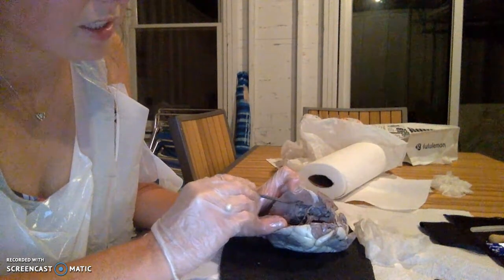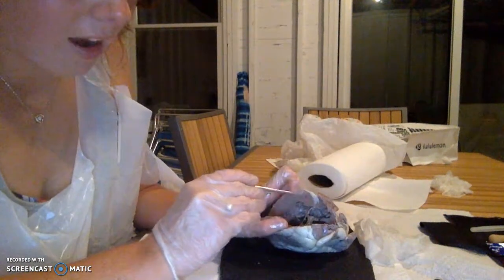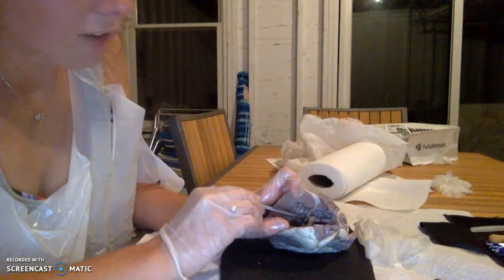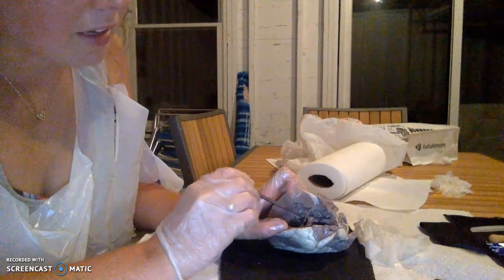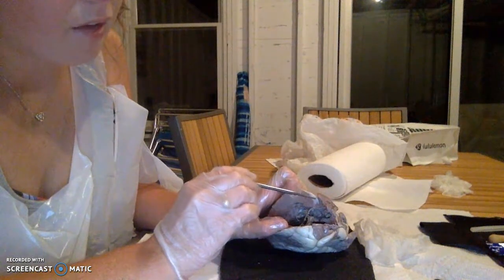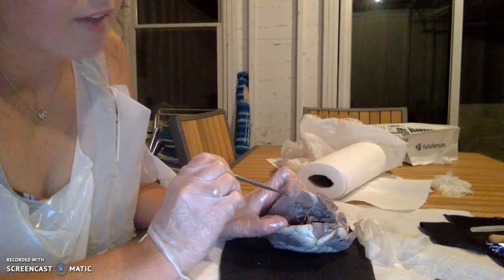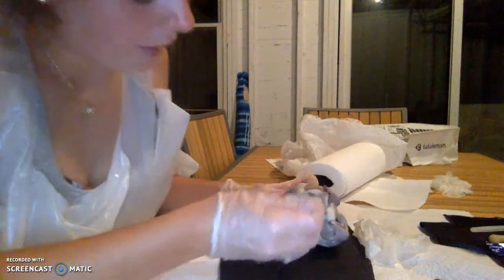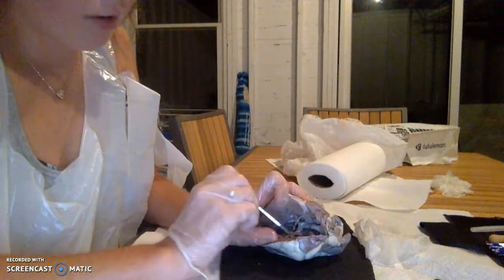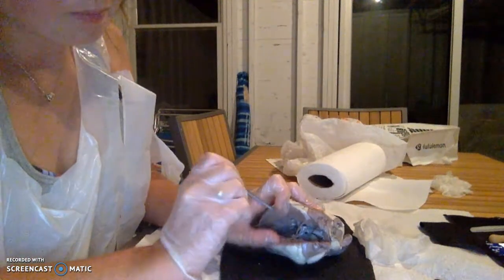You have the spiderweb-like structures right here, which is the chordae tendineae. And then you have the mitral valve, which is here, and that is what separates the left atrium from the left ventricle. And then also you have the aorta right here, and the aortic valve is just below it.